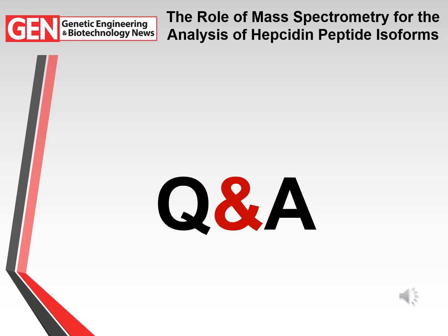There's a real push from the life sciences to get better separations faster, and sometimes we're doing less with the chromatography and more and more with the mass spec. So we're making very significant demands on the performance and robustness of mass spec systems as we move into high throughput metabolic profiling.